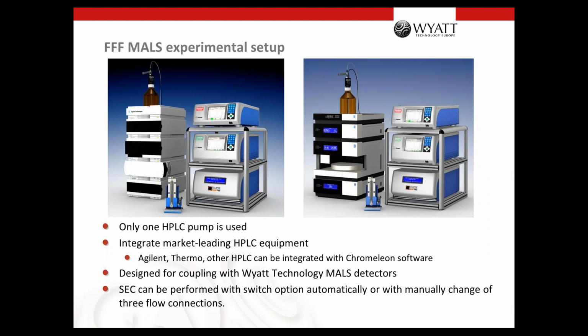Another advantage of using this setup is that it is very easy to use the same HPLC as well for FFF and for SEC. And this could even be done automatically by a valve inside the Eclipse. So then you need to use an FFF system with a switch option. And that automatically switches between SEC and the separation channel.